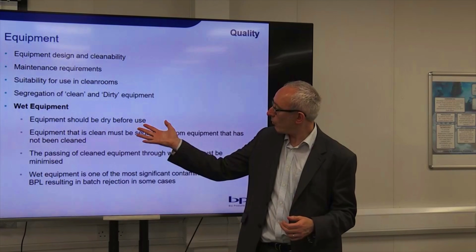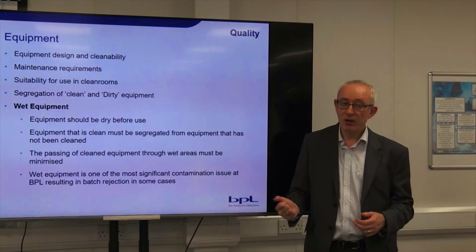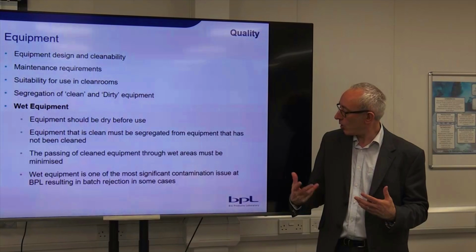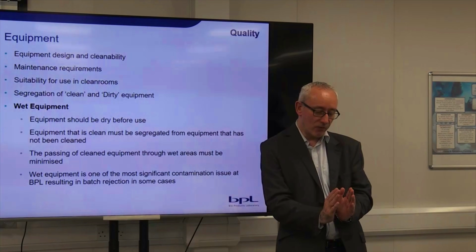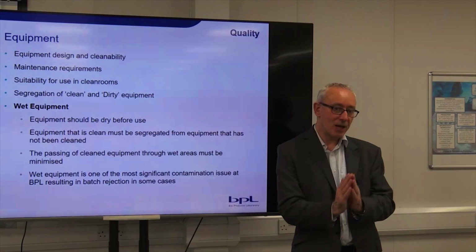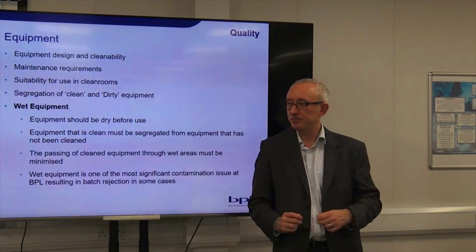And then we've got this whole wet equipment issue that we've discussed earlier, where we want to avoid that at all costs, and just this whole issue of a piece of equipment that we believe to be clean becoming recontaminated.